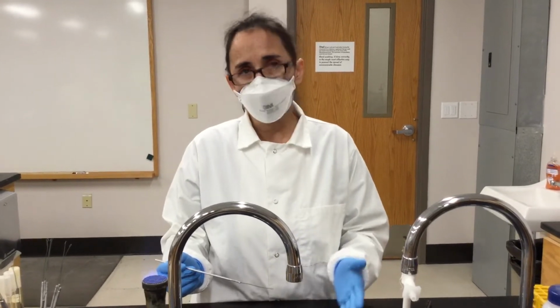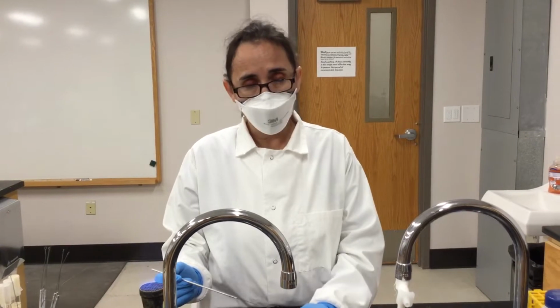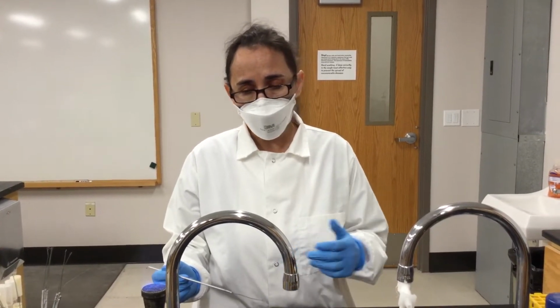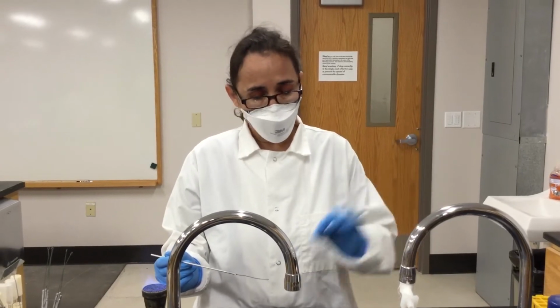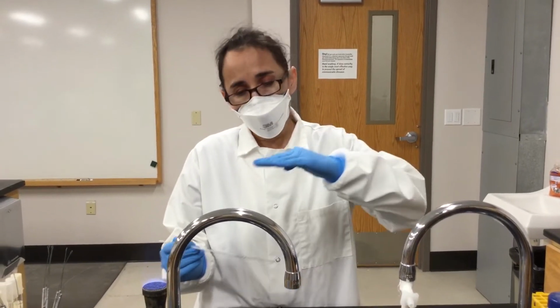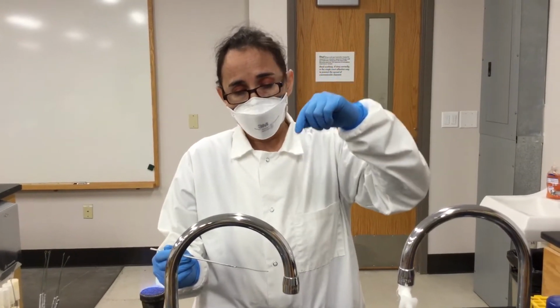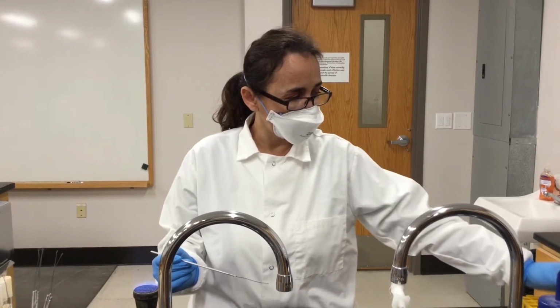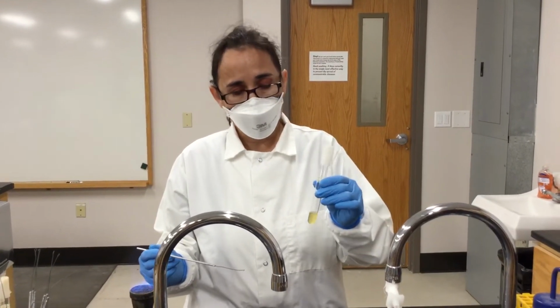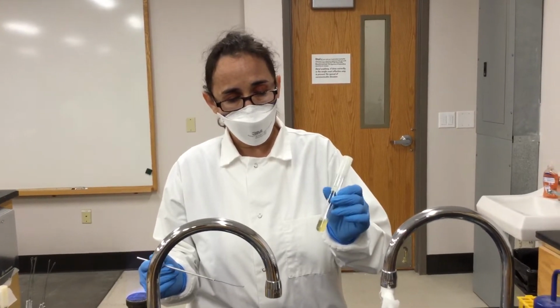And if you use solid media, you have to put a drop of water into the area where you're going to set the smear, so you can have the film very thin, and you don't end up with a lot of bacteria preventing the stain or the dye from penetrating into the bacterial cells. So first I'm going to make this smear using this liquid media, which is a broth.